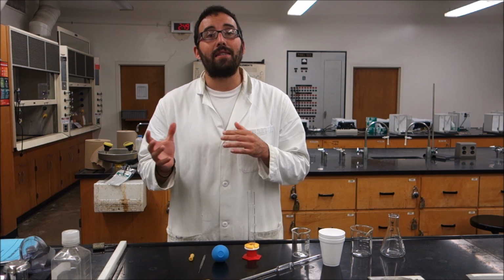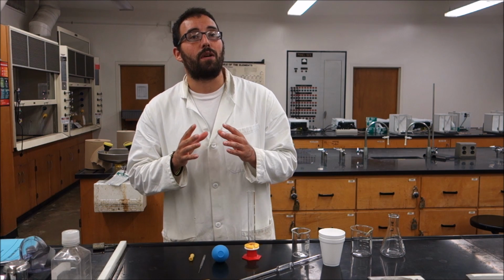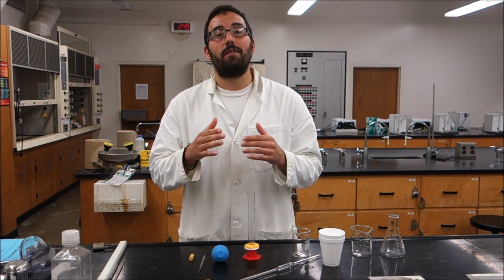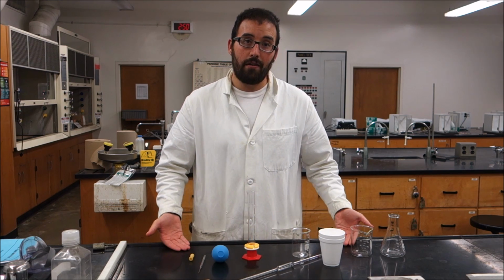Today we're going to talk about experiment number 7. Experiment number 7 is on calorimetry, which is the study of heat exchange. Today's experiment is actually going to be designed by you. I'm just going to give you a few different hints in this video to help you set up your experiment. The whole purpose of this experiment is we're going to have a hot water sample for you, and you're going to have to use some equations and an experiment to figure out the temperature of that initial hot water. Some of the supplies you can use are here in front of me.